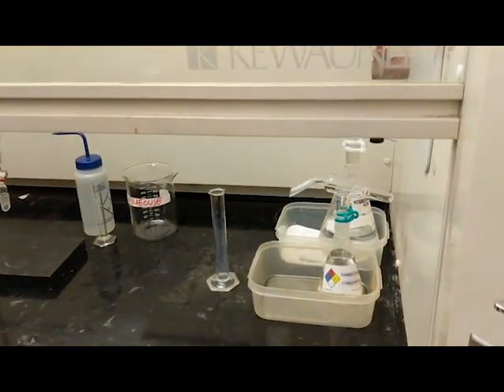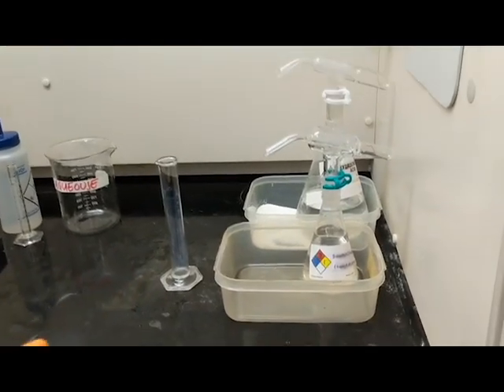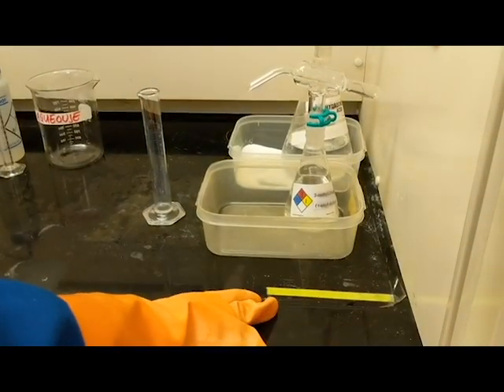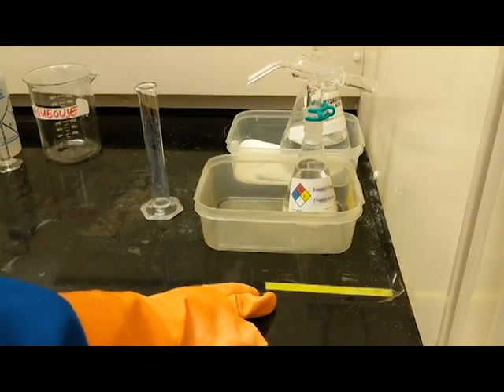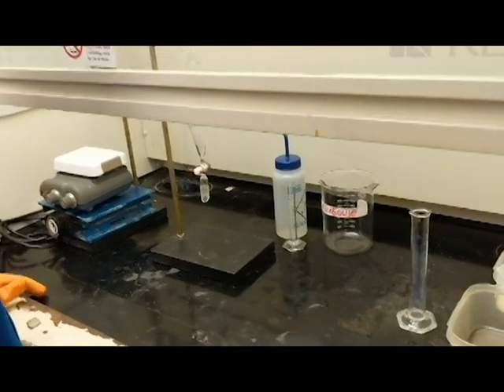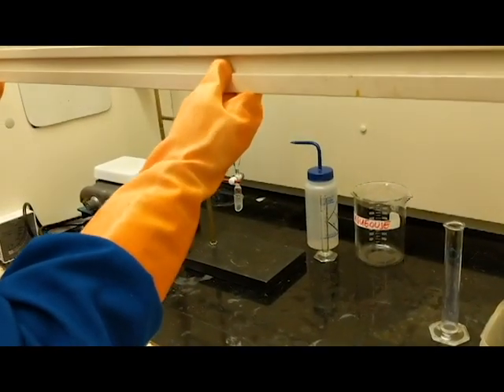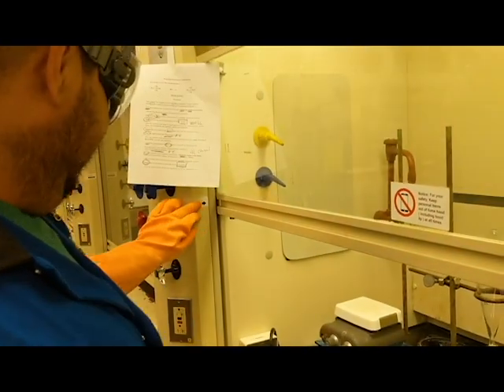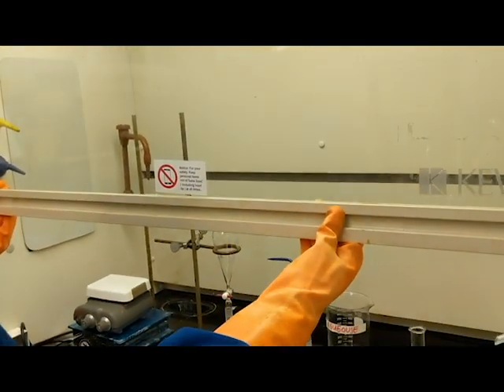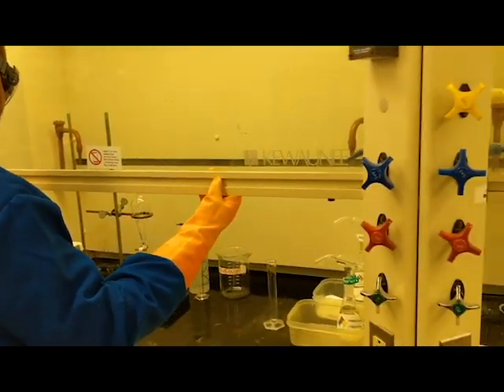The solutions are on my right-hand side. Notice that they are beyond the neon green line that is inside your hood. All of your chemical solutions need to be worked with beyond that line. And notice that the hood sash is indicated by this arrow here. This is where you're getting the optimal ventilation so that you know that you're being safe.